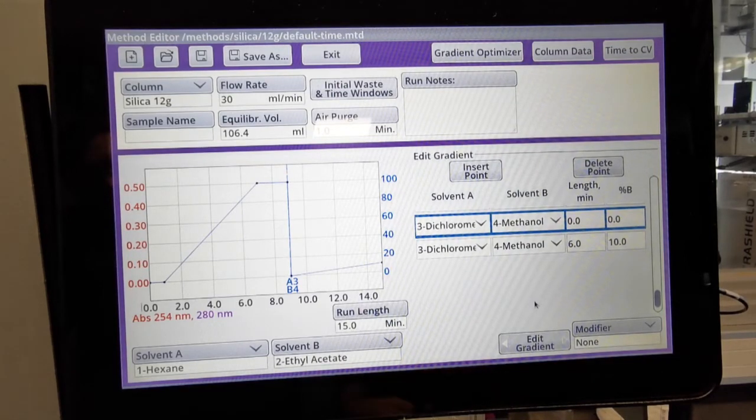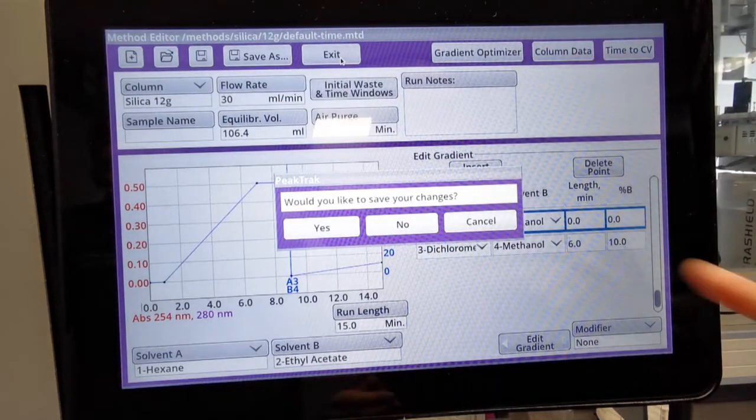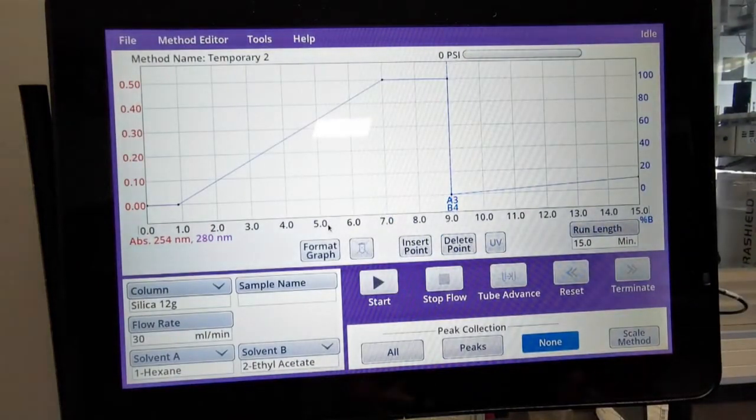Hit the exit button, it'll ask you if you want to save it, and then you're ready to start your run. So for those more tricky separations where you've got some closely eluting compounds, simultaneous gradients is a really good way of separating those out so you end up with the purest fraction of your compound of interest. Thanks very much for listening.